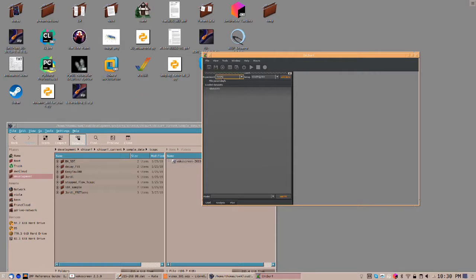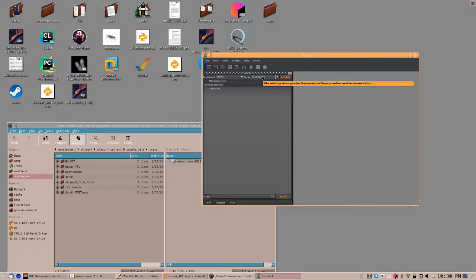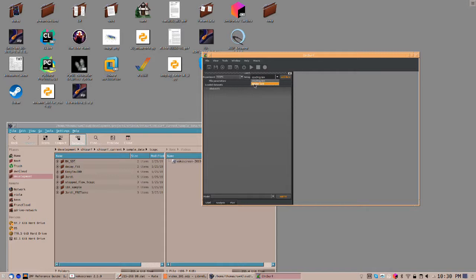To open a dataset for fluorescence decay analysis, first specify the experiment type. Next, specify the file type and the setup option. Here, currently, there are two different setups supported, either comma-separated value files or Becker & Hickl SDT files.